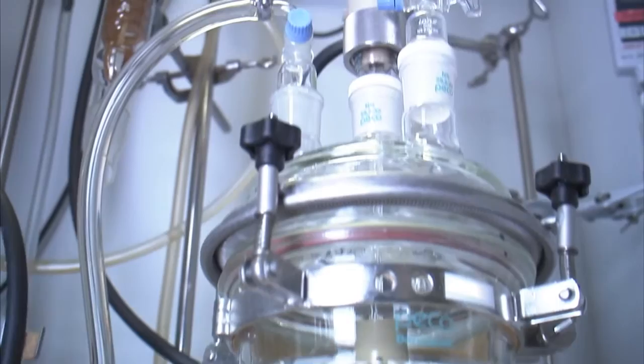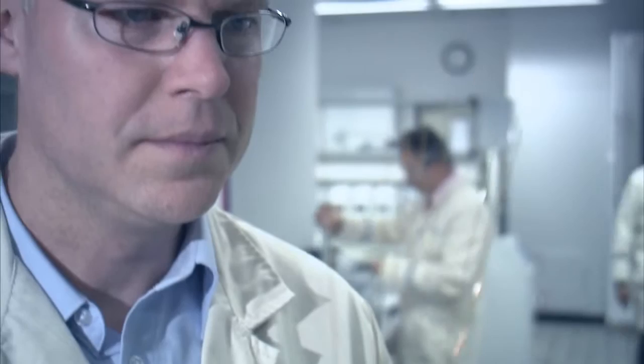The strong interest in micro and nano HPLC is being excellently served with Merck's offering of in-situ synthesized monolithic silica capillary columns.